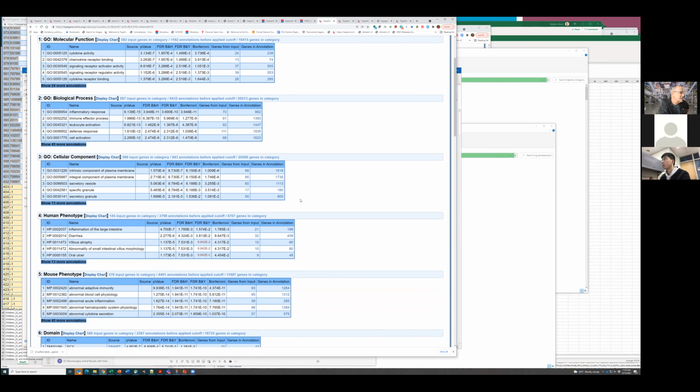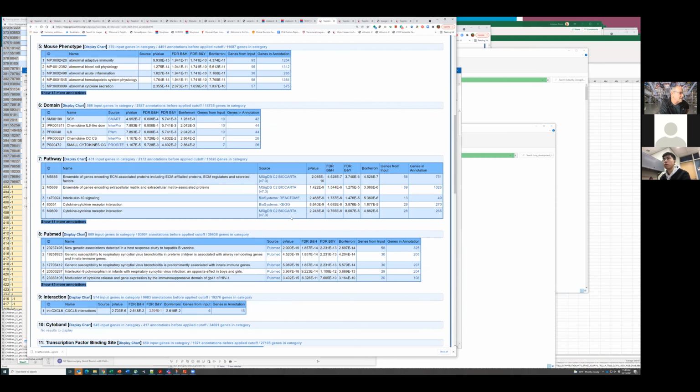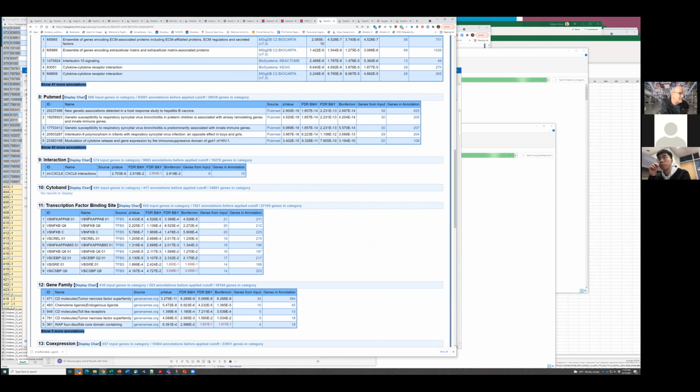But then if you look at the underlying cis-regulatory elements in those genes, look at that. It's all NF-kappa B. Incredible enrichments for NF-kappa B in those, and when you take these genes and spread them out over those different cell types, you'll see it's NF-kappa B pathways in those different cell types. Because remember, we were looking at this view.